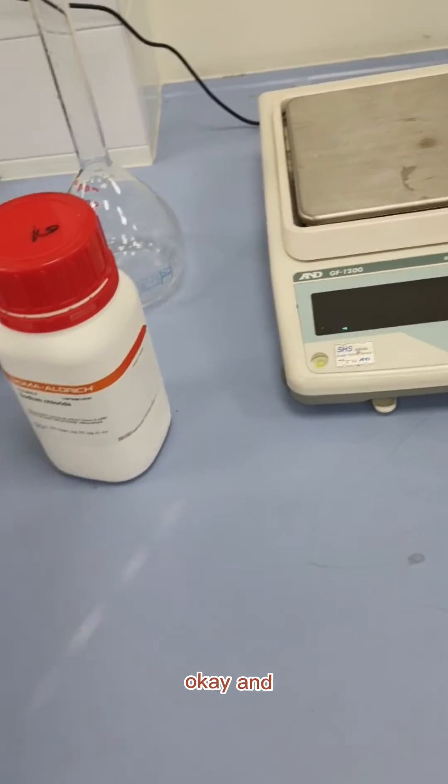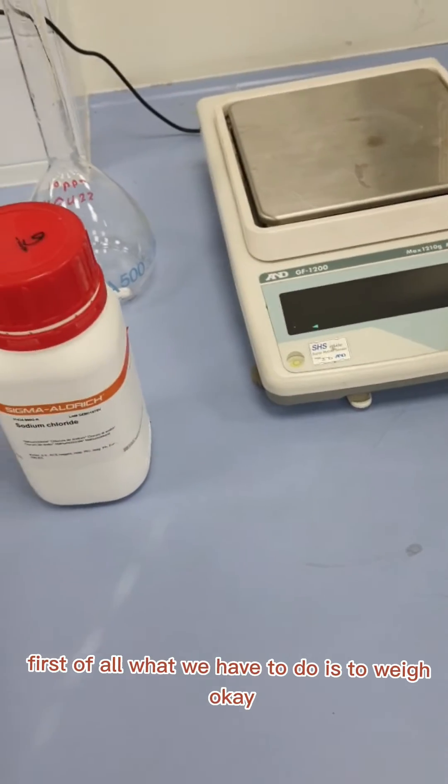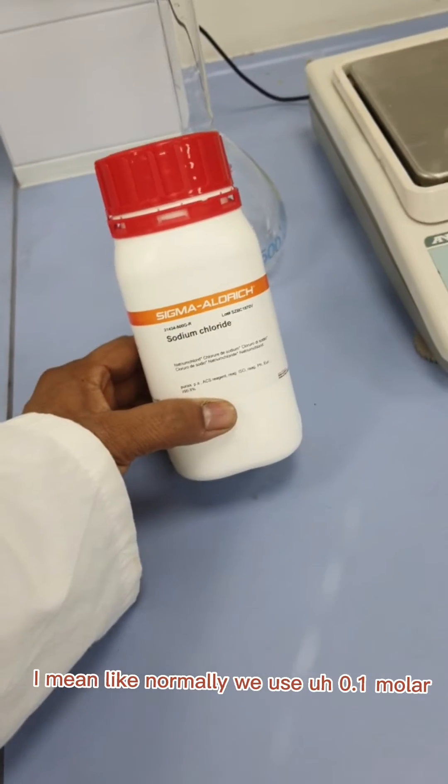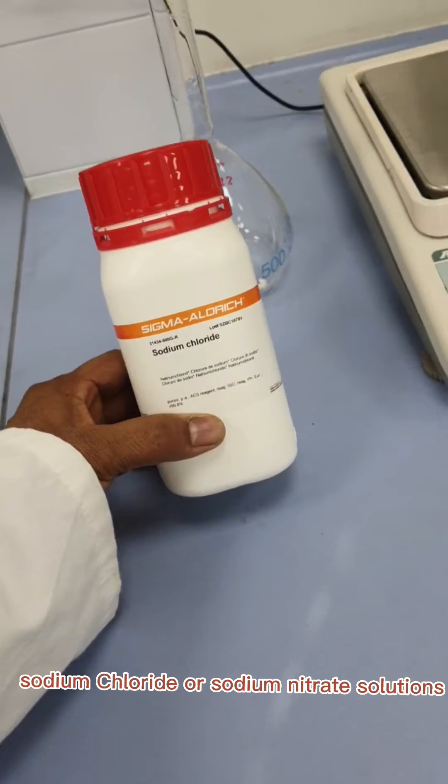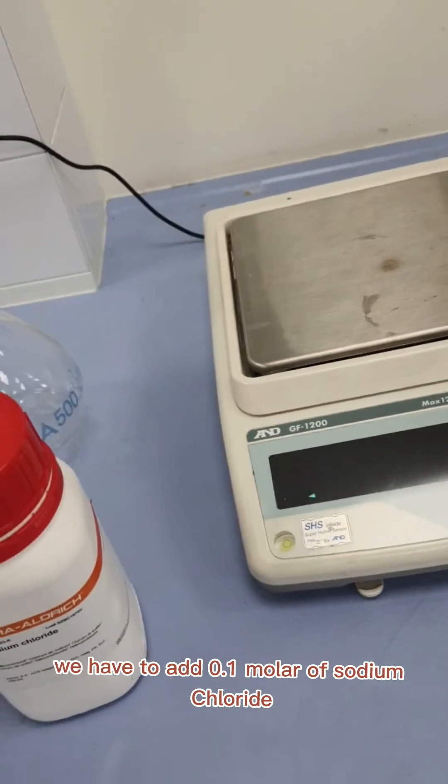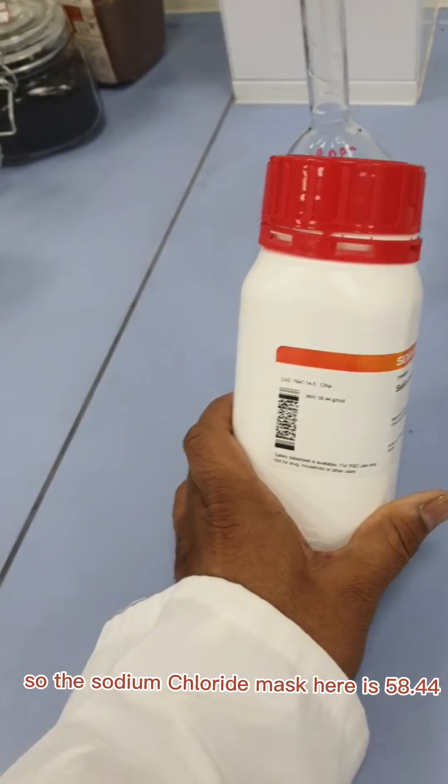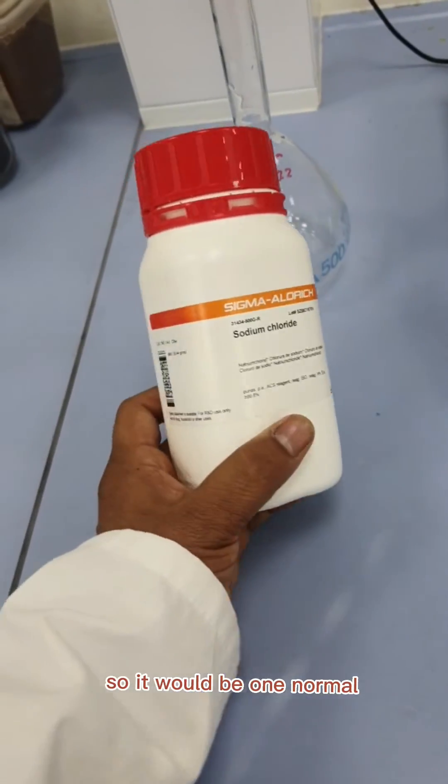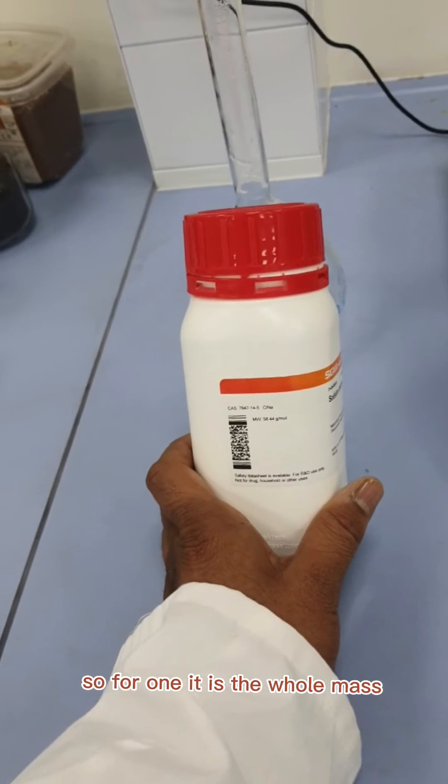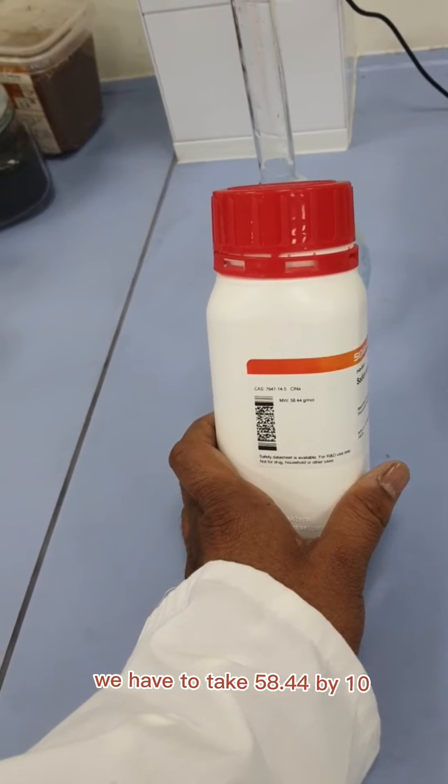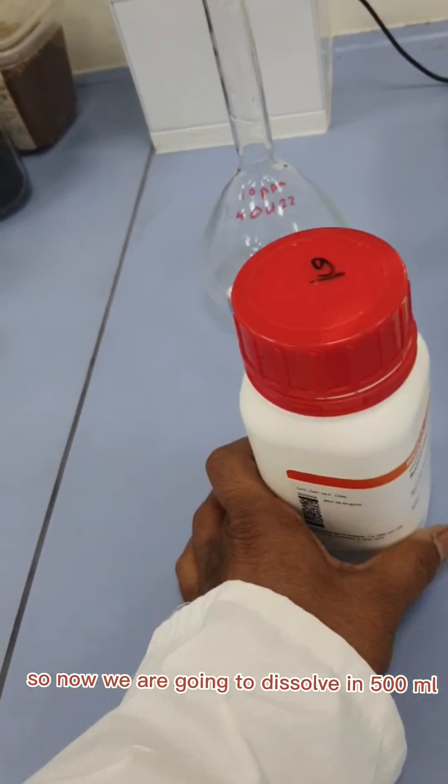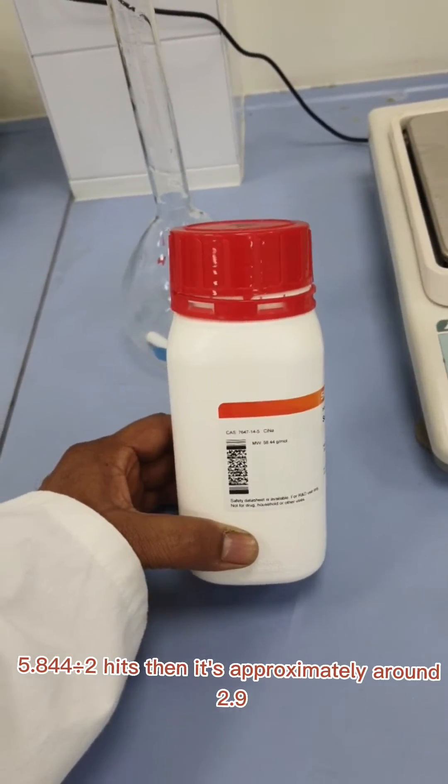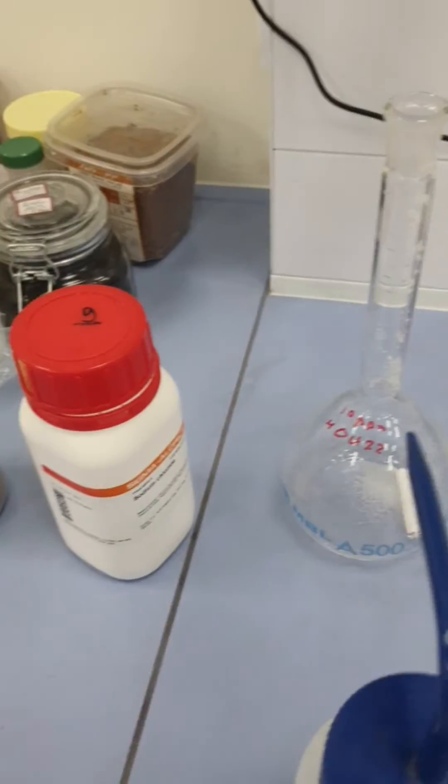For this point of zero charge experiment, first of all we have to weigh the right amount of sodium chloride or sodium nitrate solution. We need to add 0.1 molar sodium chloride. The sodium chloride mass is 58.44, so if we dissolve 58.44 in one liter it would be one molar. For 0.1 molar we take 58.44 divided by 10. Since we're dissolving in 500 ml, we take 58.44 divided by 2, which is approximately 2.9 grams.